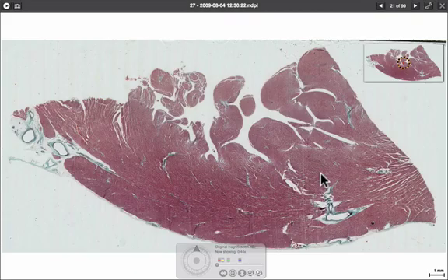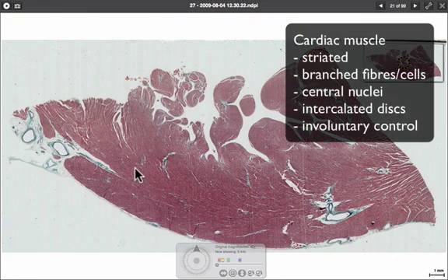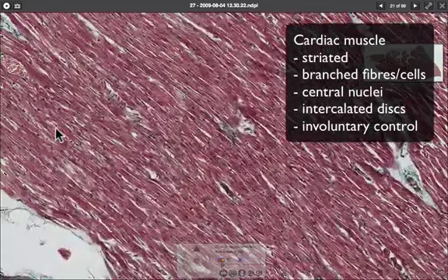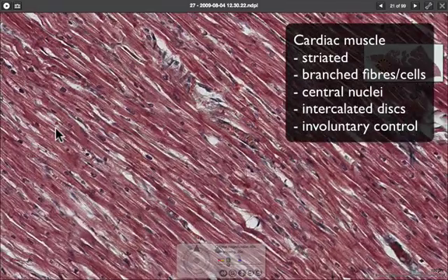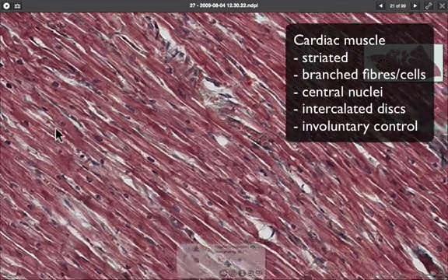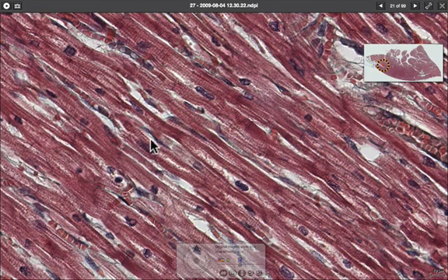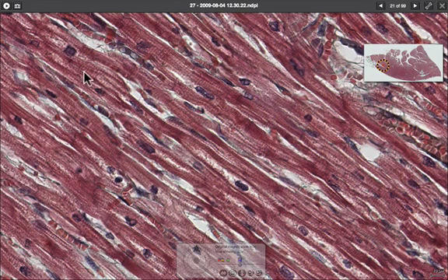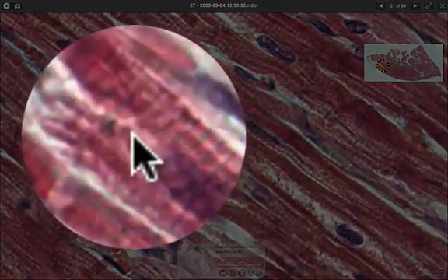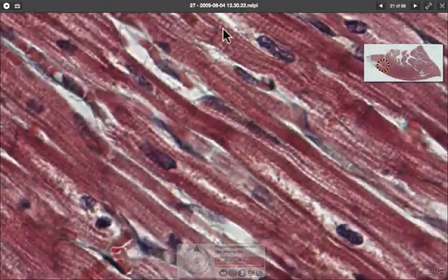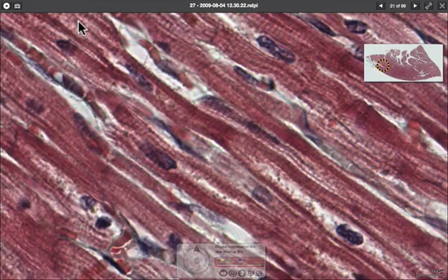This is cardiac muscle — a slice of heart. Zooming in on the fibers, we can see features that distinguish them from skeletal muscle. First, the location of the nucleus is central rather than peripheral — we can see the nucleus right in the center of each fiber. Second, there are clear striations visible across the fibers.